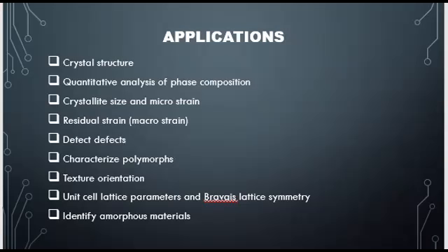It is used for finding the crystallite size and microstrain, but it can also look at the strain on a macro scale, also known as the residual strain.